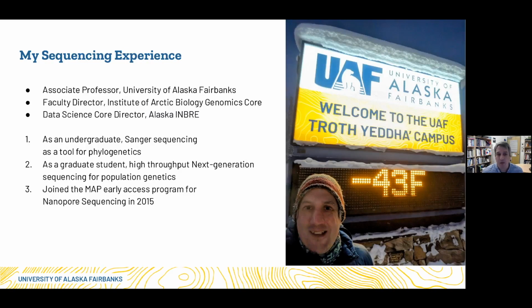So a little bit more about me and my experience with sequencing technology. As an undergraduate, I was using Sanger sequencing as a tool for understanding phylogenetic relationships. And then as a graduate student, I moved on to next generation sequencing as a tool for understanding questions in population genetics. About 9 years ago, I joined the MinION Access program, the MAP program, for nanopore sequencing, and I've been using nanopore sequencing ever since. So just a little bit about my background using these kinds of tools.